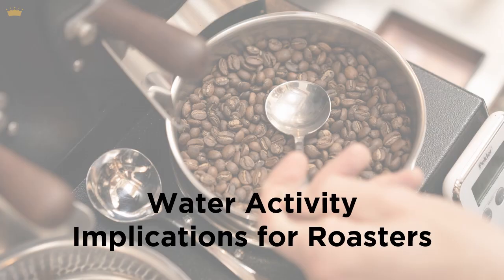So let's now consider what the implications of water activity might be for roasters. And I like to think of these as being able to be broken down into three essential categories. The three S's of water activity for the roaster. The first would be safety, the second would be shelf stability, and the third would be sugar browning.